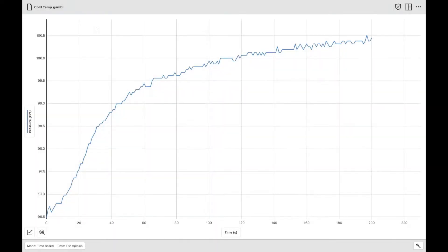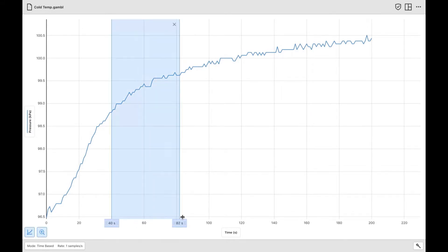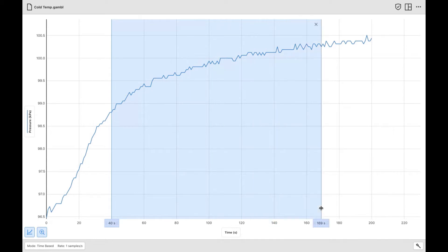If you're watching this video, you used temperature as your experimental variable. So we're going to look at the data for cold temperatures and compare it to our baseline temperature. The first thing I'm going to do is highlight from 40 seconds to 200 seconds.